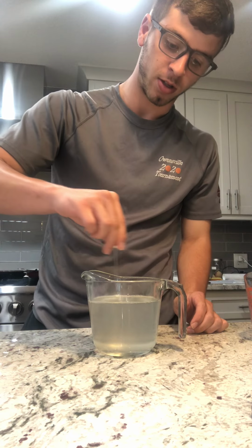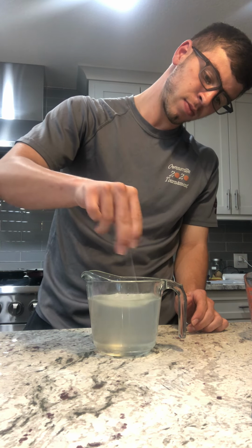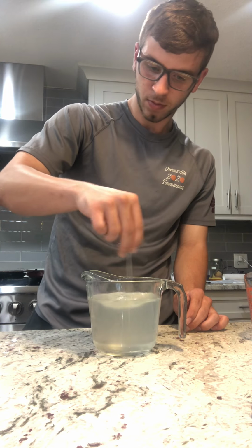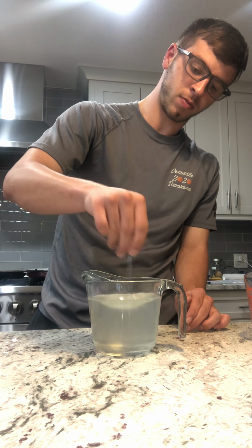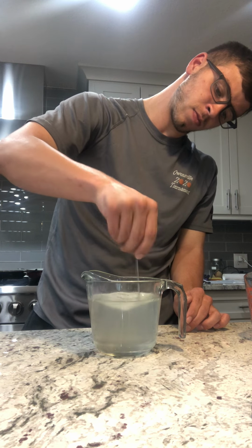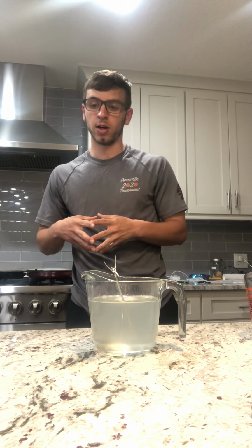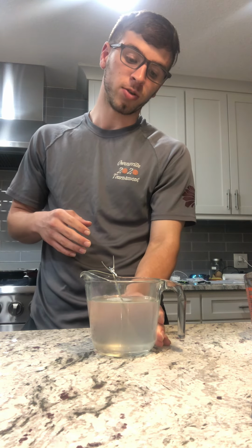In order for me to speed this up, I can try to stir it. The reason it's taking so long could be because there's too much of a concentration of vitamin C, making it take longer than it should, or the temperature of this could be too low for what we're looking for.